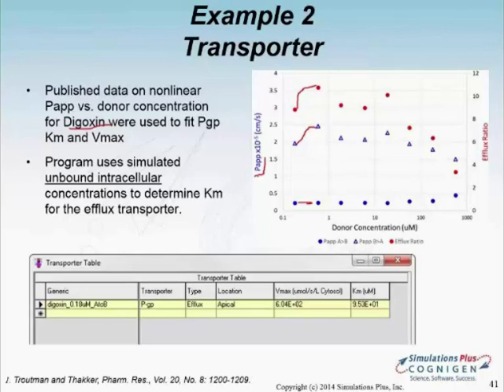That comes down to the comment that I made earlier. A lot of these system parameters, we can provide some defaults, but your culture conditions, your addition or not of certain components will be heavily affecting some of these aspects. We can provide some basic default values, but a lot of this physiological information would be dependent on the user.